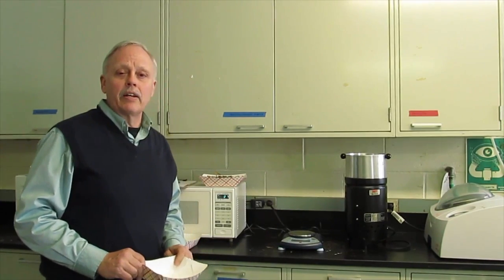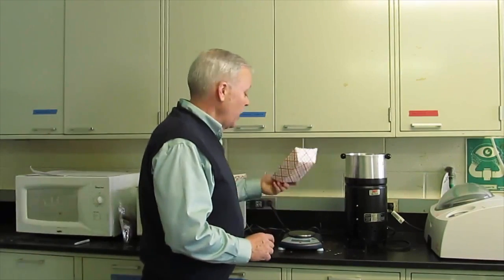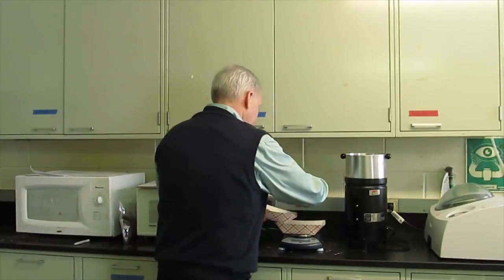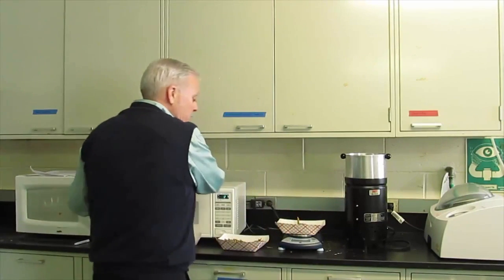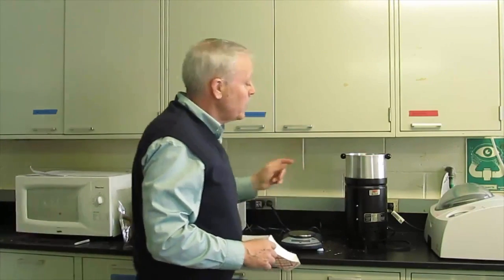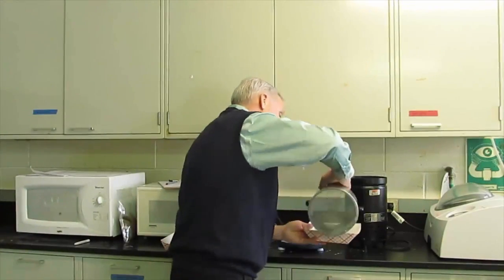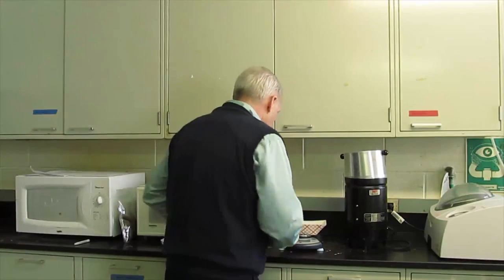The Koster Tester is another system for analyzing dry matter on the farm. Take a paper plate, put about 50 grams of sample on it, record the weight, and then put it in the Koster Tester. Spread it out to make sure it's evenly spread over the screen. Let it go for 30 minutes, then come back, take the weight, put it back in the pan, and record the weight.